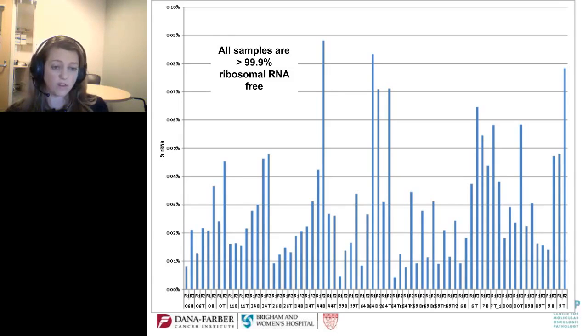The result of that study was that between 40 and 60% of our reads were ribosomal or mitochondrial in origin. So going forward, we wanted to assess the same sample types with ribosomal depletion in place.